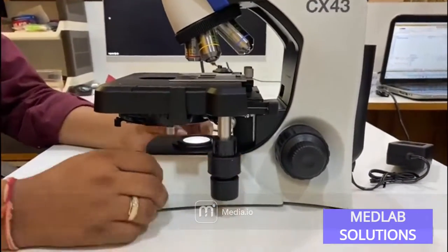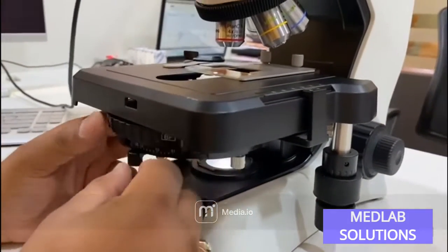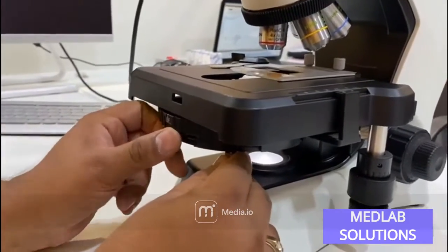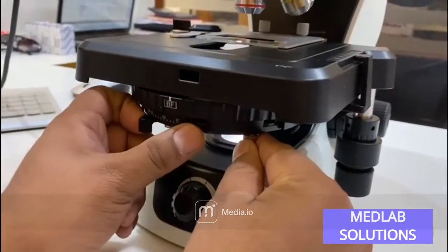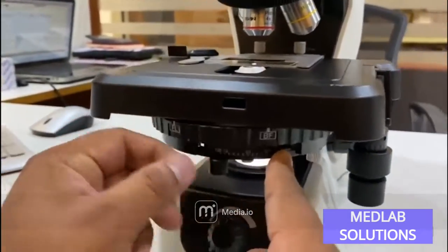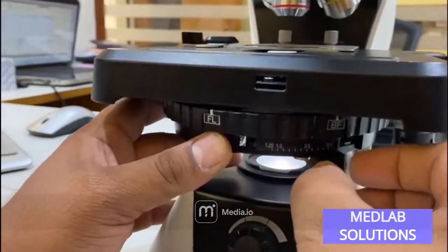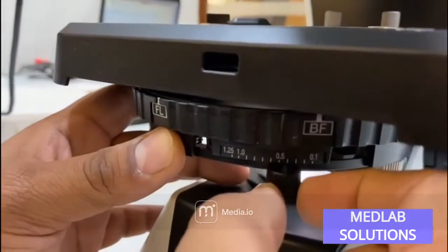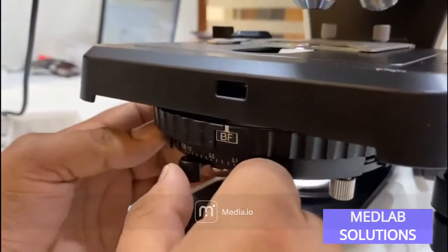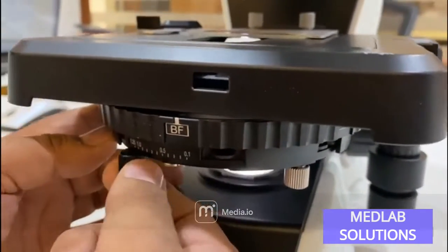Ergonomically, you also get a turret position to increase or decrease the diaphragm directly overhead. As you can see, there is a turret movement to choose the diaphragm setting as per your requirement — 0.1, 0.5, 1, and 1.25. This allows you to adjust contrast in bright field mode using the diaphragm.